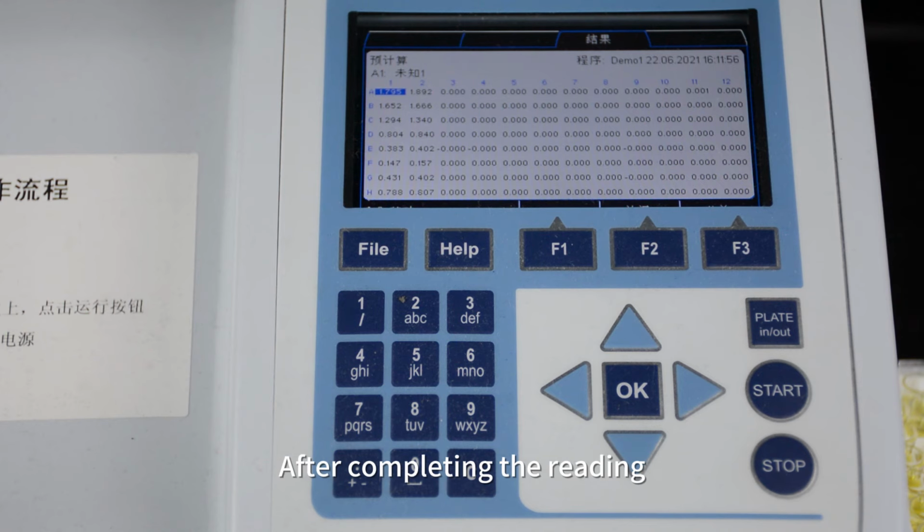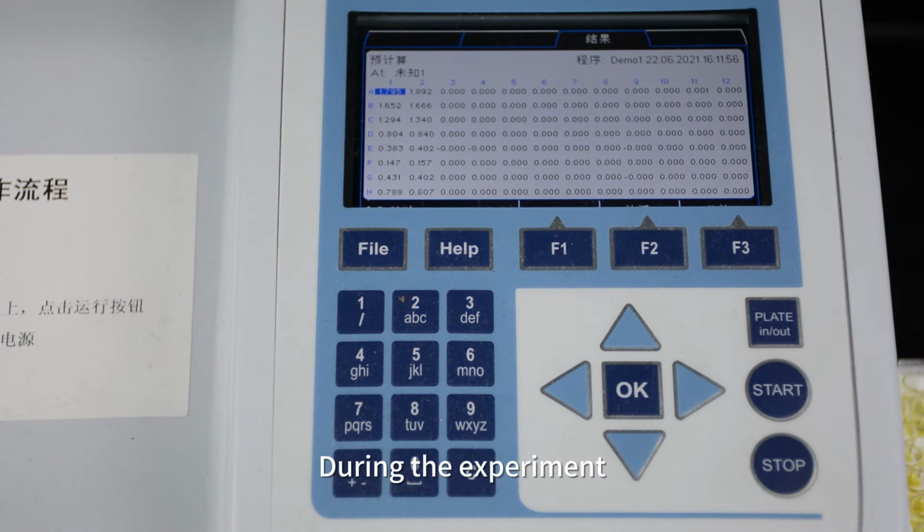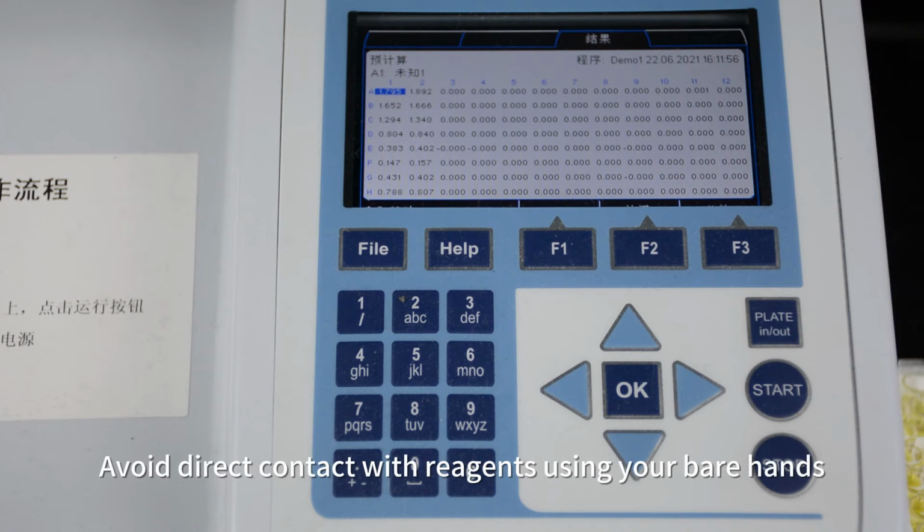After completing the reading, the reaction solution should be disposed of in a designated waste container to prevent environmental contamination. During the experiment, always remember to wear lab coats, gloves, masks, and more. Avoid direct contact with reagents using your bare hands.